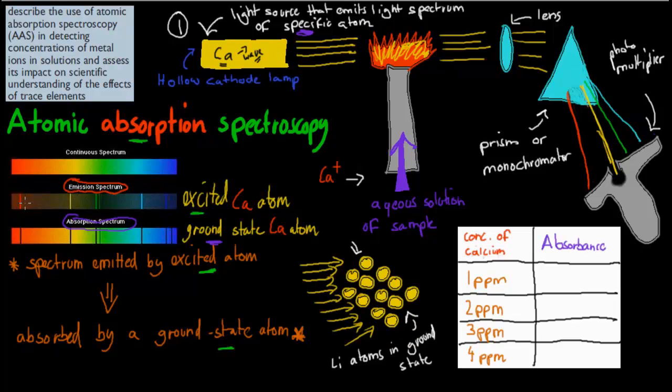Emission spectrum. So the actual lamp will just produce these different types of wavelengths, because we're only wanting to find out if there's actually calcium in that, how much calcium there is in that sample. So this is the first step. We've got the lamp, and the second step is we have this furnace, which basically is a heat source, and this is where we put our sample in.